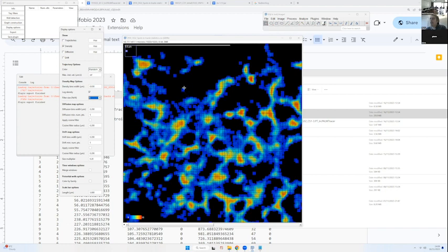Of course, when you do this local filter, it introduces artifacts, as you can see here, where it was 1 bin, now it's 5, 5, 5. But this can be interesting to just better visualize what happens in the data. All right, that's the density map.